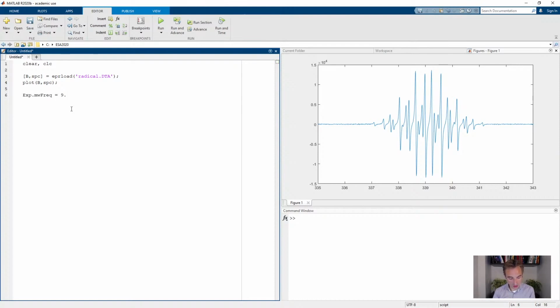So microwave frequency, I think, was 9.5, and the range we're going to, again, as previously, just copy from the experiment. Field vector with the minimum and the maximum from the field vector defining the edges. Okay, starting system Sys0.Nucs is, we have 2 protons now. We know that from the molecular structure, and we know that we've got 5 of the first type and 3 of the second type. Should be Sys0.